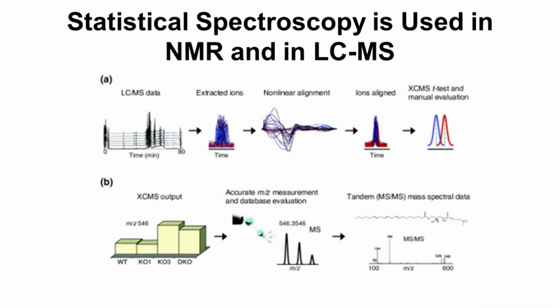And it's only after we've simplified this collection of thousands and thousands of peaks to perhaps a few dozen that we go to the effort of identifying those peaks and perhaps trying to quantify them if we can.